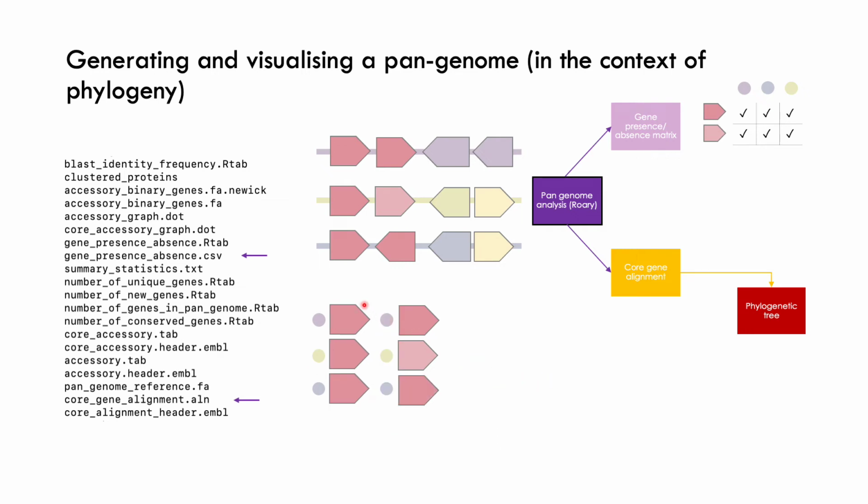And so we take each gene and we align them per each genome. Just like the alignment that I showed from BLAST before, instead of having 2 sequences, in this case we'd have 3 of each gene. And then we concatenate those alignments, so basically just string them together and make one master alignment rather than lots of individual alignments.